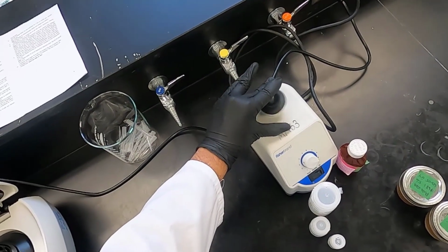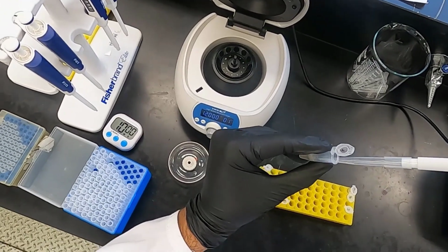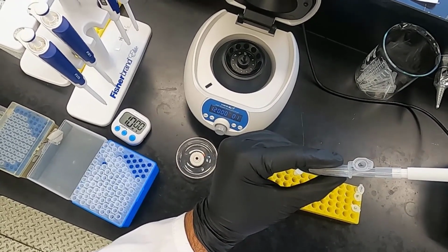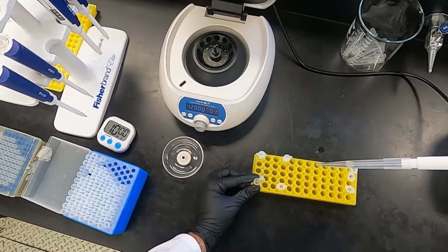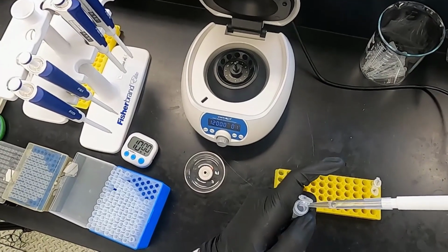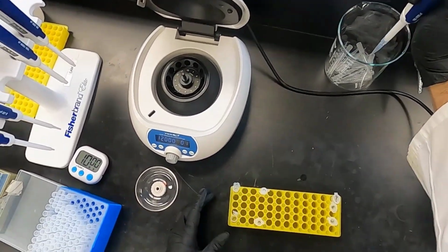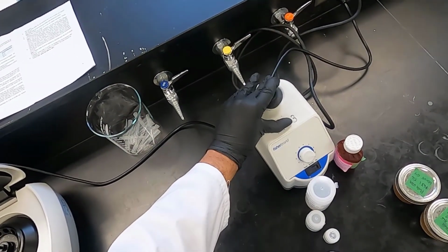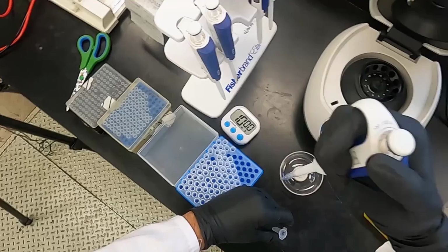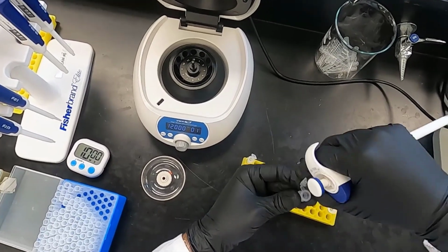Vortex before you collect the sample. If your sample is less than 500 microliters, just collect as much as you can. Now the second sample. This one, it's a little easier if we open it with 2 hands.